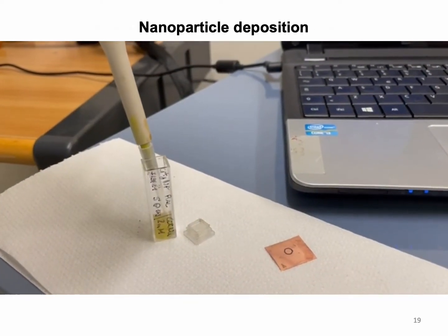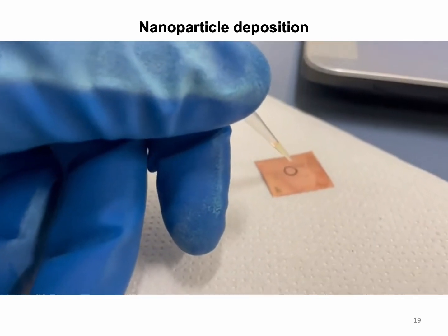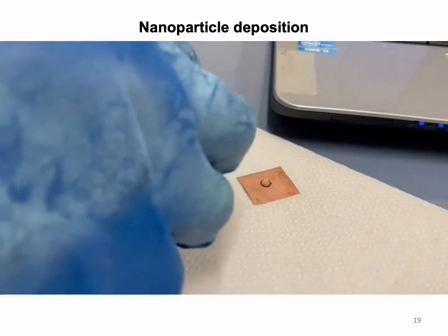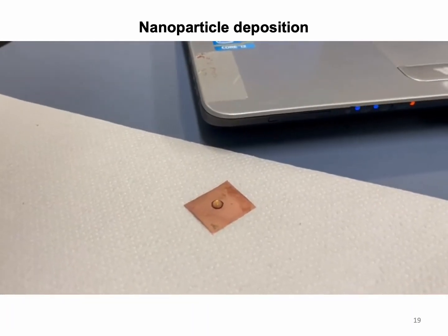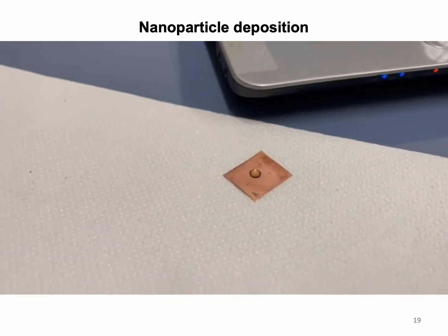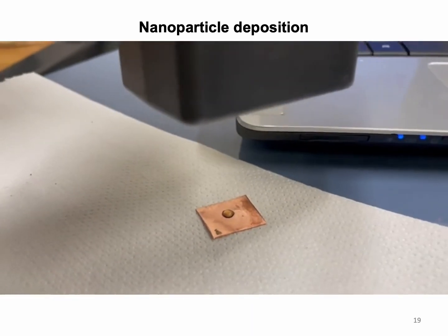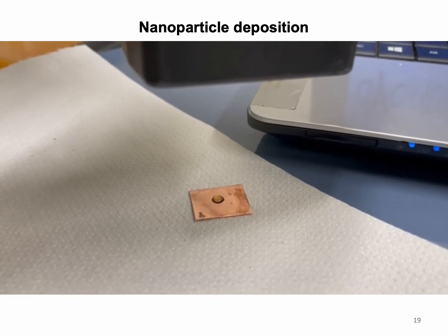But how are these nanoparticles used in LIBS? For solid samples, in this case a copper foil, the procedure is simply the deposition of a few microliters of solution directly onto the sample surface. The droplet is then dried using a jet of hot air. Once the droplet is perfectly dried, the LIBS measurement can be performed. The whole procedure takes just a few minutes to complete.